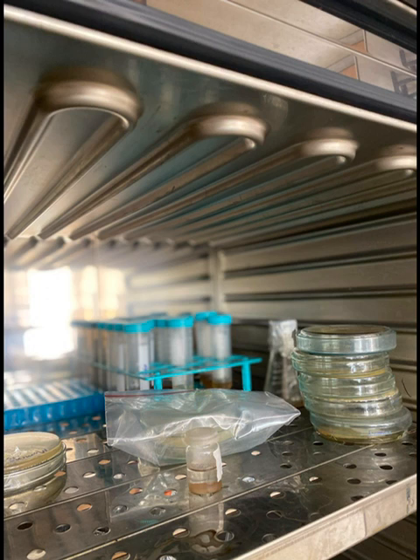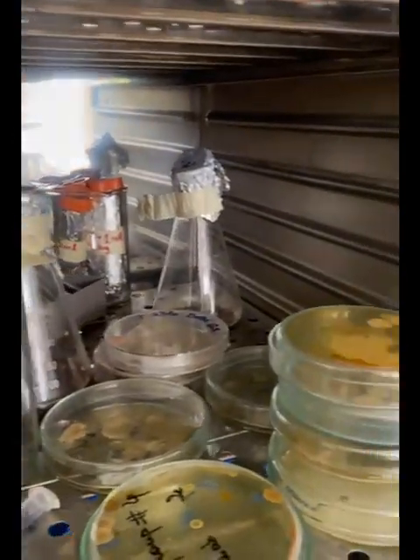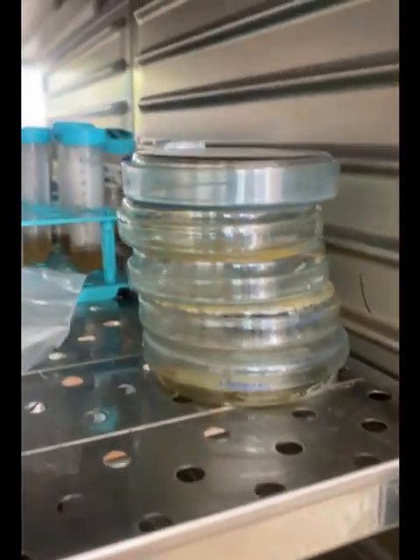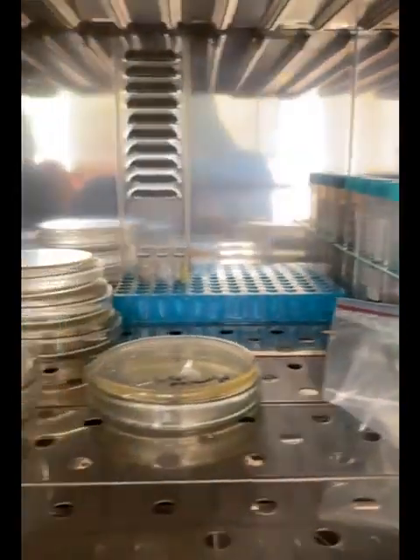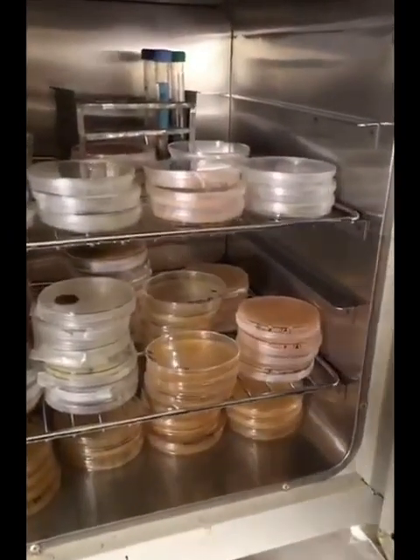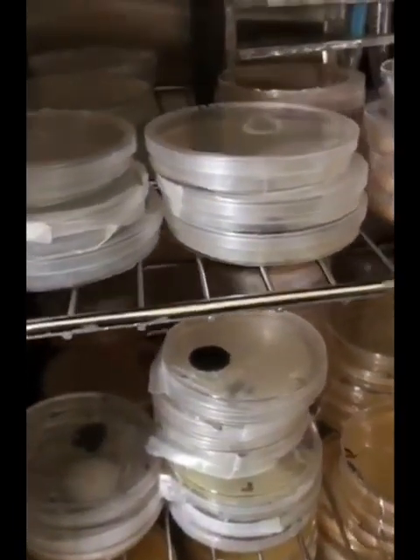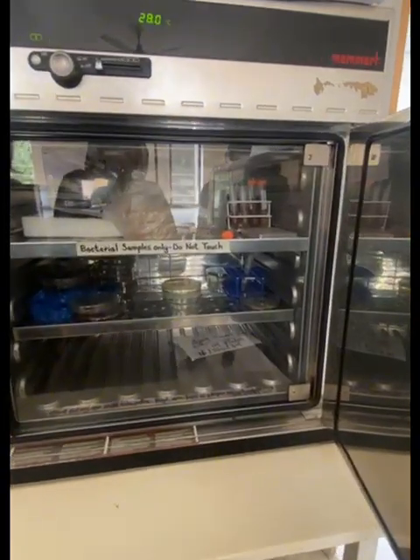Some microorganisms, particularly those used in cell culture, require specific atmospheric conditions, such as controlled levels of carbon dioxide. Growth incubators can regulate the gas composition within the chamber to meet these requirements. Placing petri dishes in the incubator protects the cultures from external disturbance and provides a stable environment for observing and monitoring. By incubating petri dishes in a controlled environment, researchers can ensure that the conditions are optimized for the growth of the specific microorganisms or cells they are studying. This enhances reproducibility and reliability of experimental results.